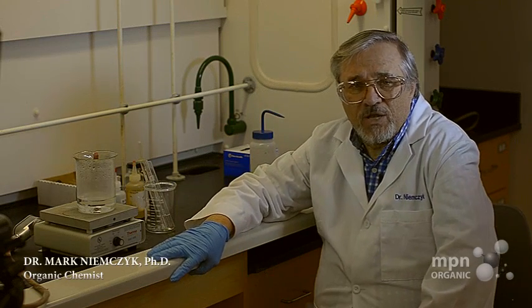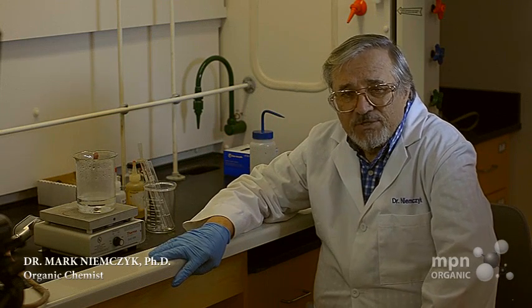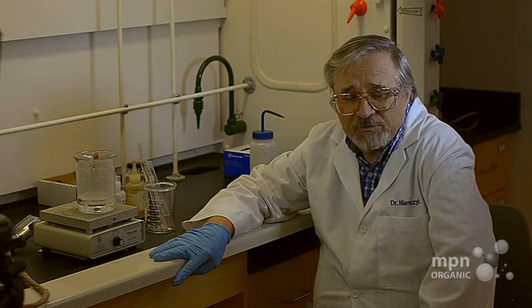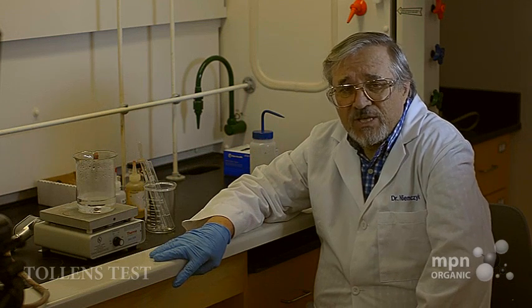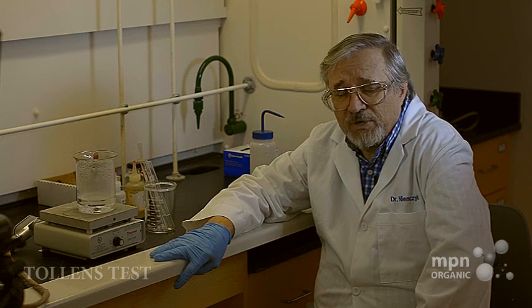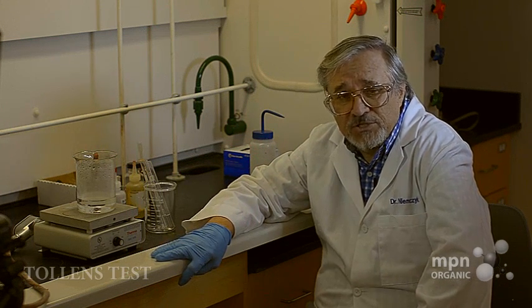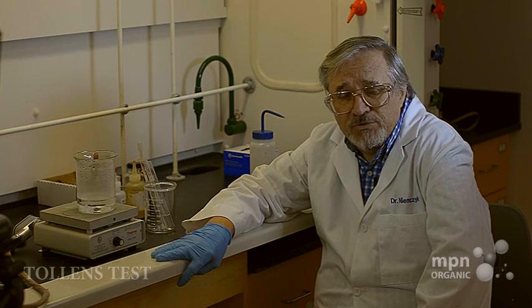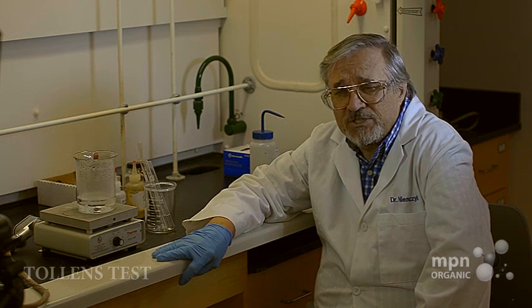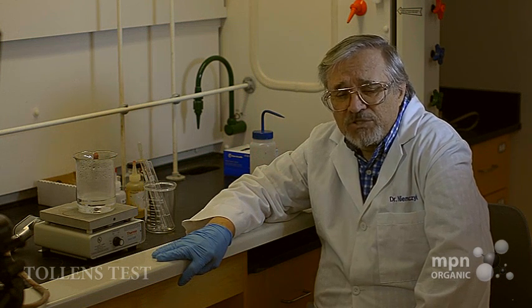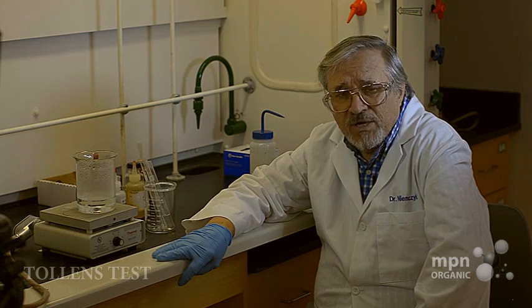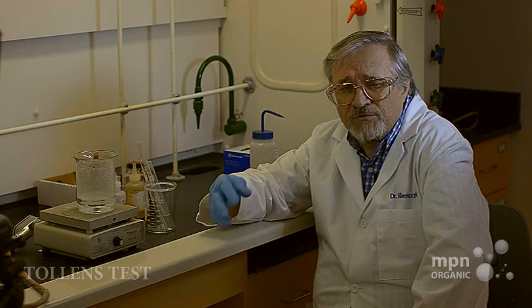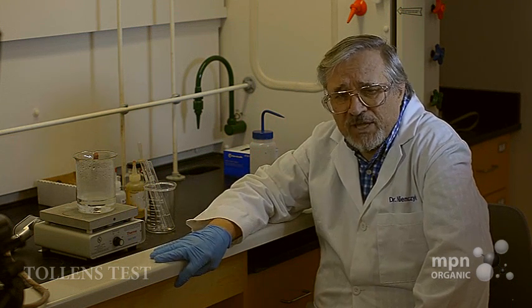In your experience in qualitative organic analysis, you're going to run up against a test that we call the Tollens test. The Tollens test was discovered by a fellow named Bernhard Tollens many, many years ago, and it is used to detect aldehydes because aldehydes are the most easily oxidized of all the functional groups that we actually come in contact with.